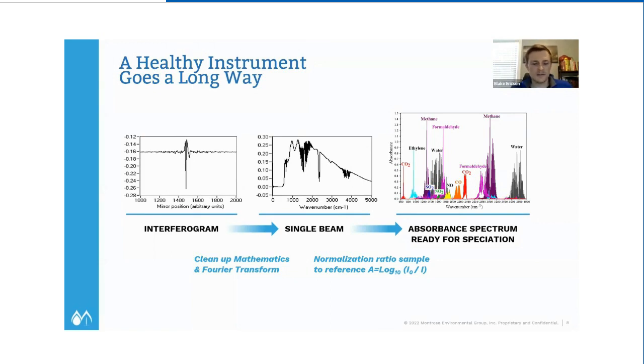But just know that's my thought with the FTIR. I think that's why it's so powerful. And that's why I'm going to really press the issue of data validation today. If your firm does not validate their data, you need to start doing it today. And I'm sure I'm going to say that 5 to 10 more times as we go, because I think it's something that really needs to be pushed with this technology.